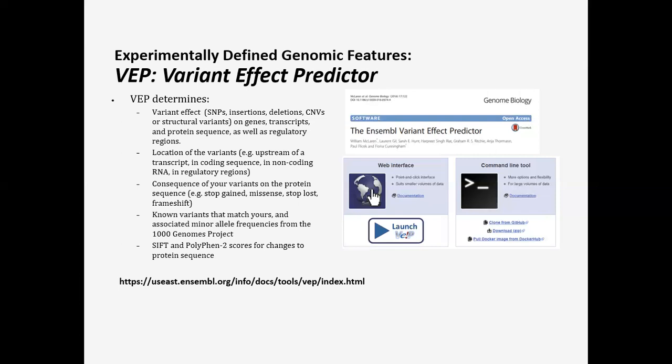Okay. So same thing, if you take CLC or any other database software, all these databases will be integrated there. There is no doubt about it. But there are some other databases which are not public. But when you use these tools, they are also integrated with those databases. So you have to be very tricky.